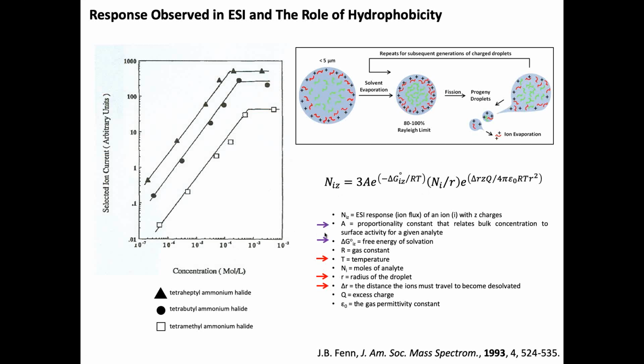So you guys in Dr. Desai's group will see this. I don't know if you're aware of this or not, but if you guys use a lot of the ion pairing agents, hexylamines, octylamines, things of that sort, you will see very clearly, if you change the length of the chain on those ion pairing agents, you will get a bump in ionization efficiency, all things being equal. And that's the same effect. Okay?